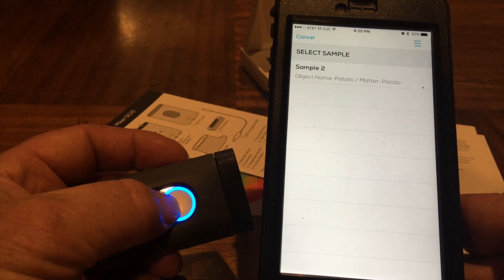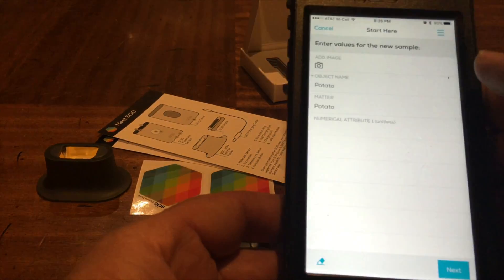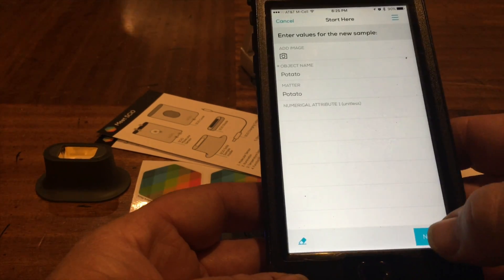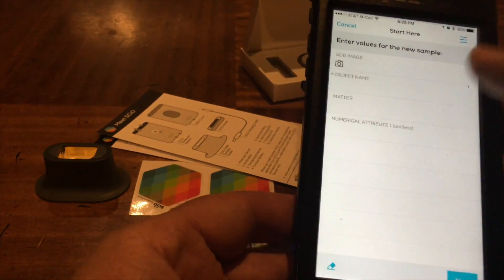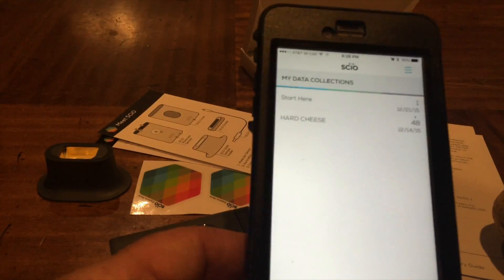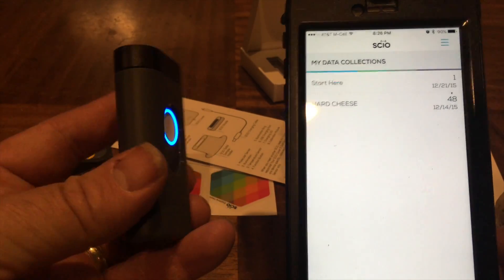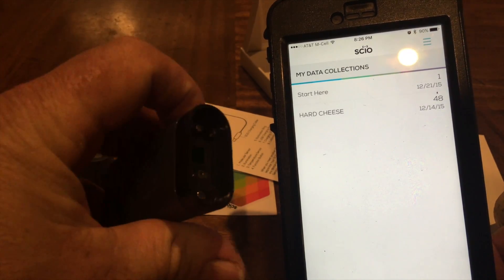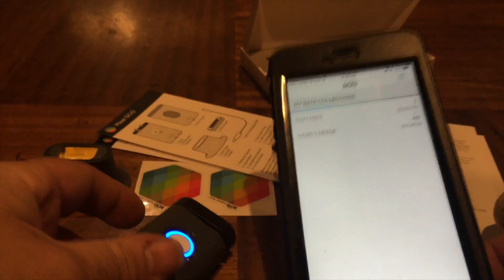I think this will only work scanning-wise when it says on the screen it's ready to scan. Oh - that erased everything. Alright, so I'm going to go watch some videos and do some research on it, and I will make another video when I have something more to share with you guys. Thanks.